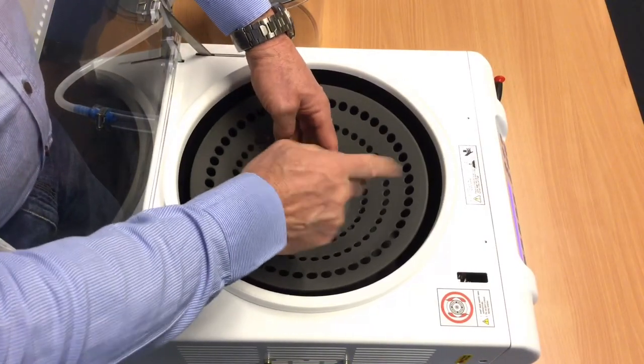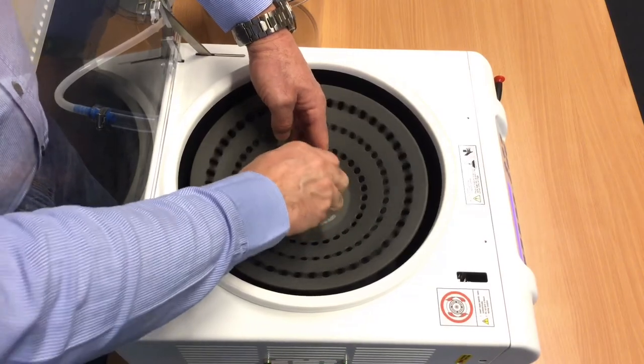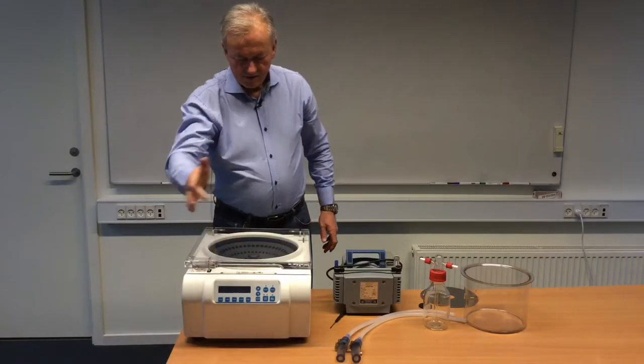We will then connect it again and close the lid, so it is now locked.